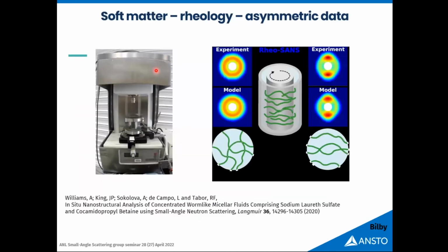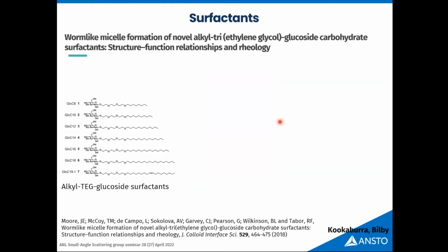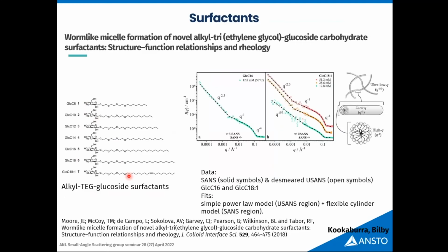The rheometer is also a very cool thing for us because, again, it's clear why. You can see the sample and see the evolution of the sample. A nice example of this work was done some time ago when we got a library of surfactants. Again, I'm not going to go deep into any scientific case here, just really to show you what we can do in a very nice, wide way. So again, it's the same logic.